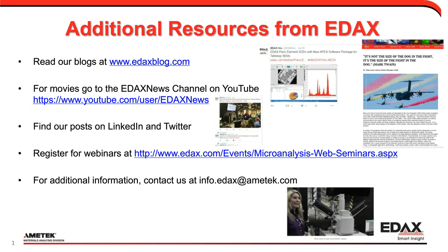Okay, and I think the final question we'll take is, what would be the maximum allowed error percent to consider the true presence of an element? Very good question. We look for the ability to distinguish the peak above background to make a conclusive determination of whether that element is present. When we report our error percentage, we report it with a statistical confidence level. Anything below 33% would be considered 1 sigma, or 1 standard deviation, likely to be present in the sample.